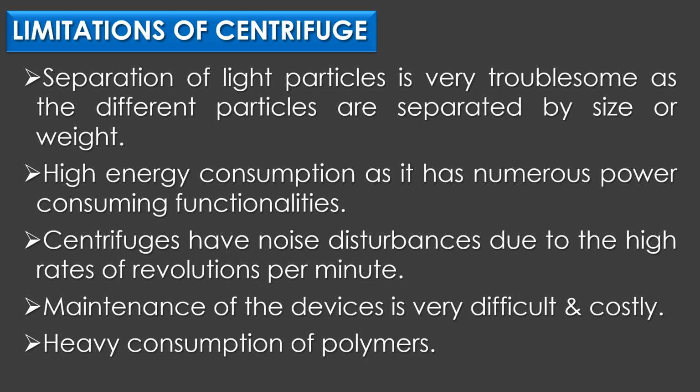The fourth limitation, maintenance of the devices is very difficult and costly because a centrifuge, despite its type, is a very complex electronic device that requires expert servicing in case of malfunctions. The fifth limitation is heavy consumption of polymers.